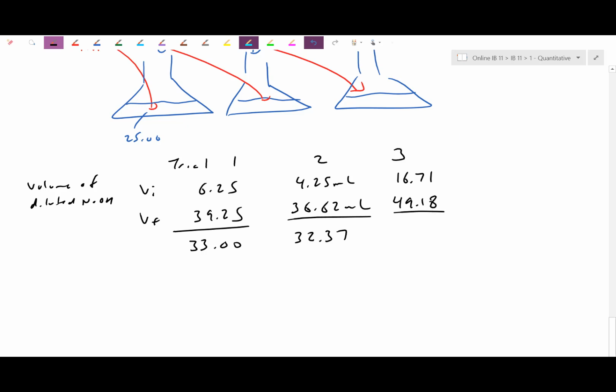It got to 49.18. I do that difference, and I get 32.47. Okay? Again, if these three numbers here were all wildly different from each other, I'd average all three. Because these two are a lot closer to each other, I'm just going to count this one here as an outlier. This one here may be overshot.